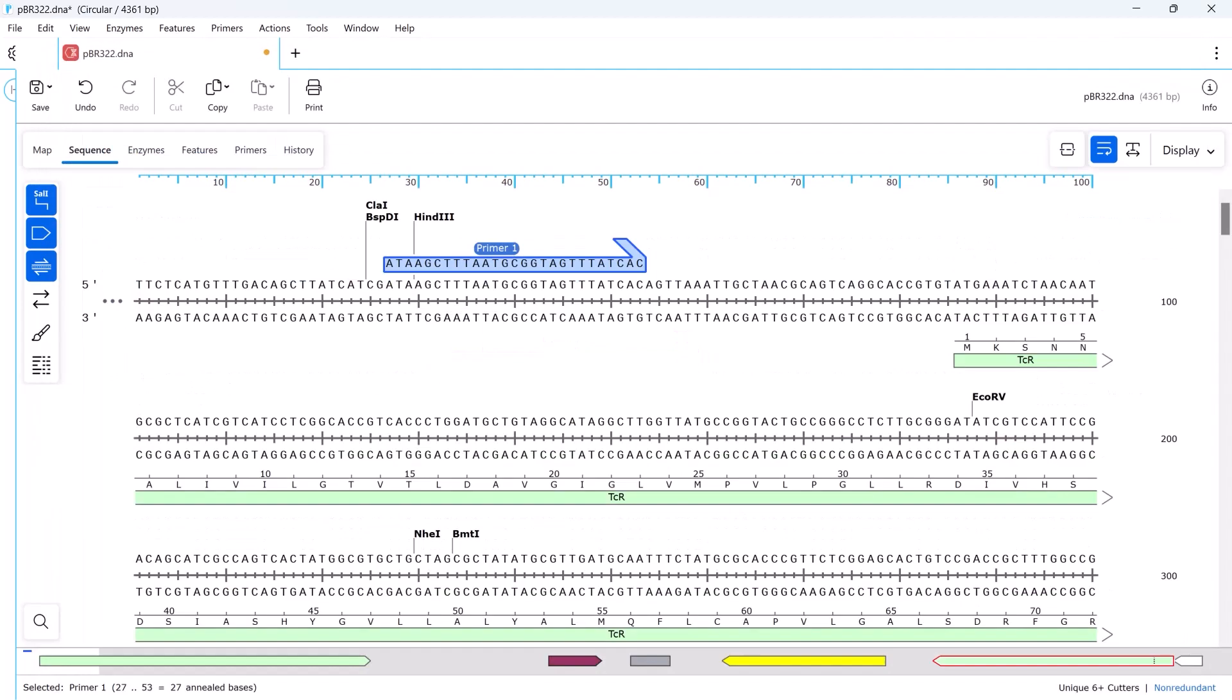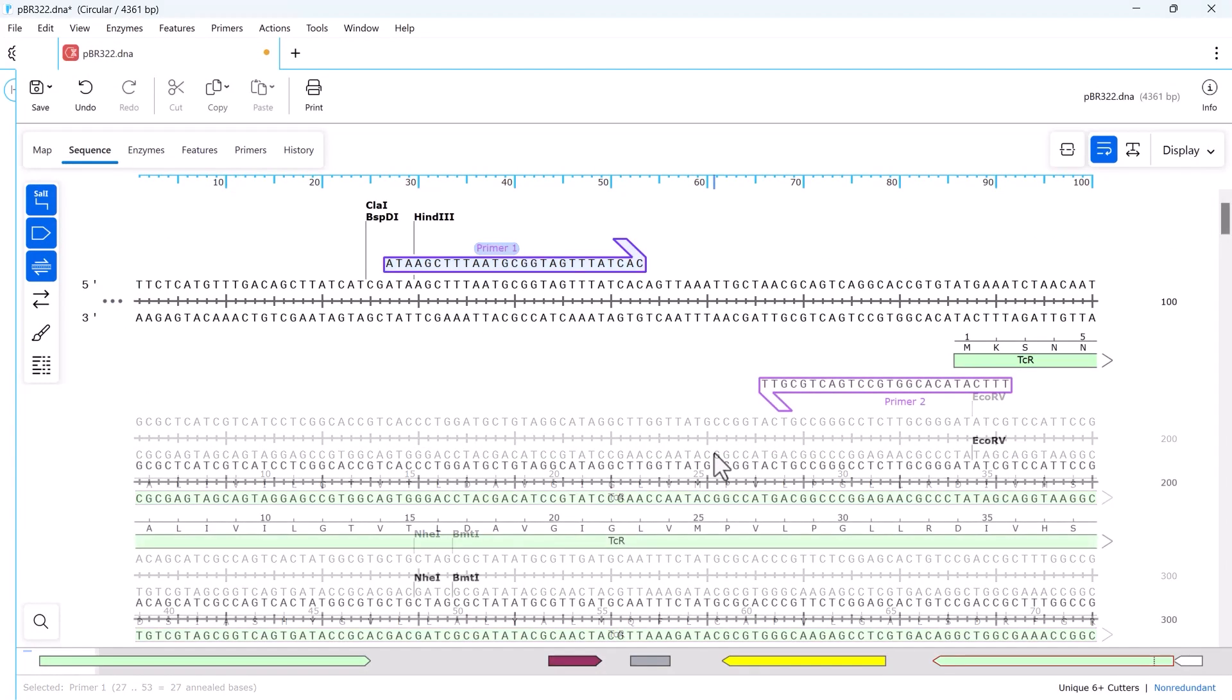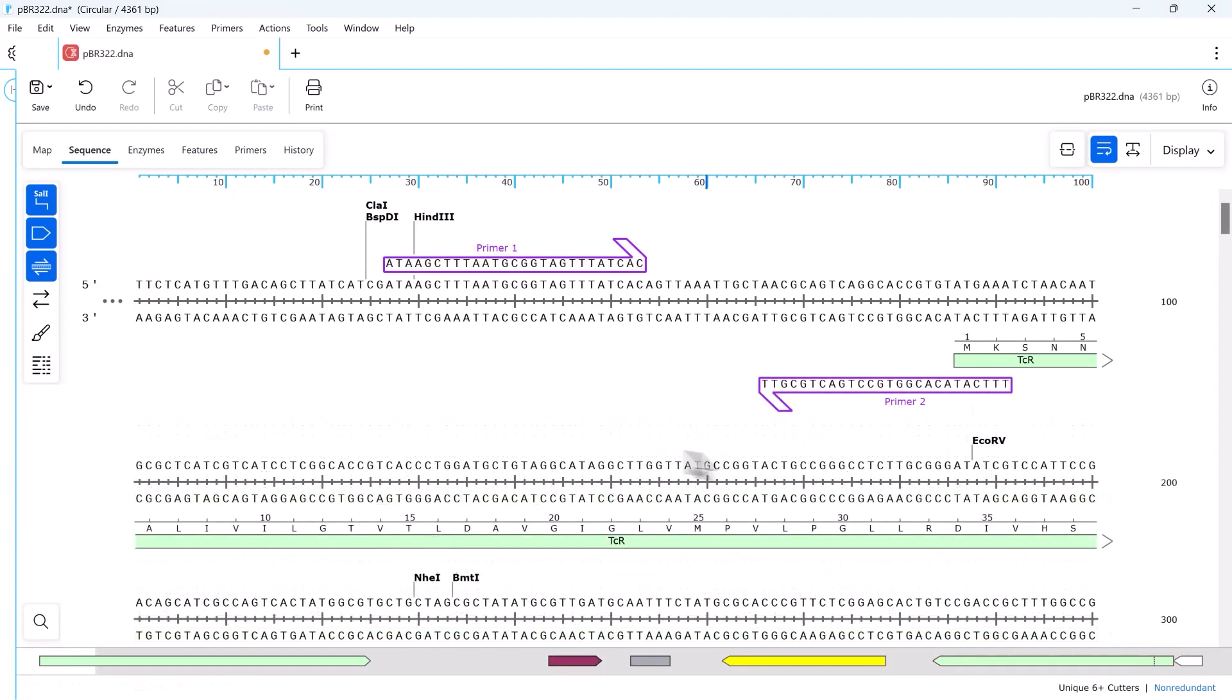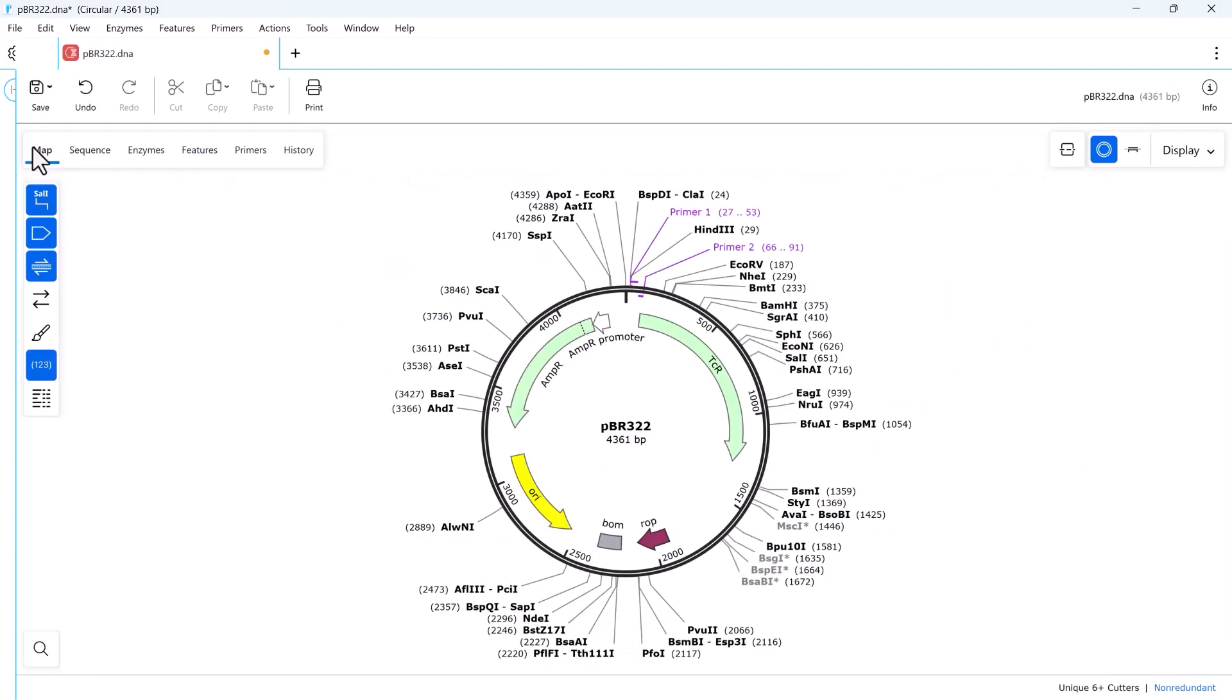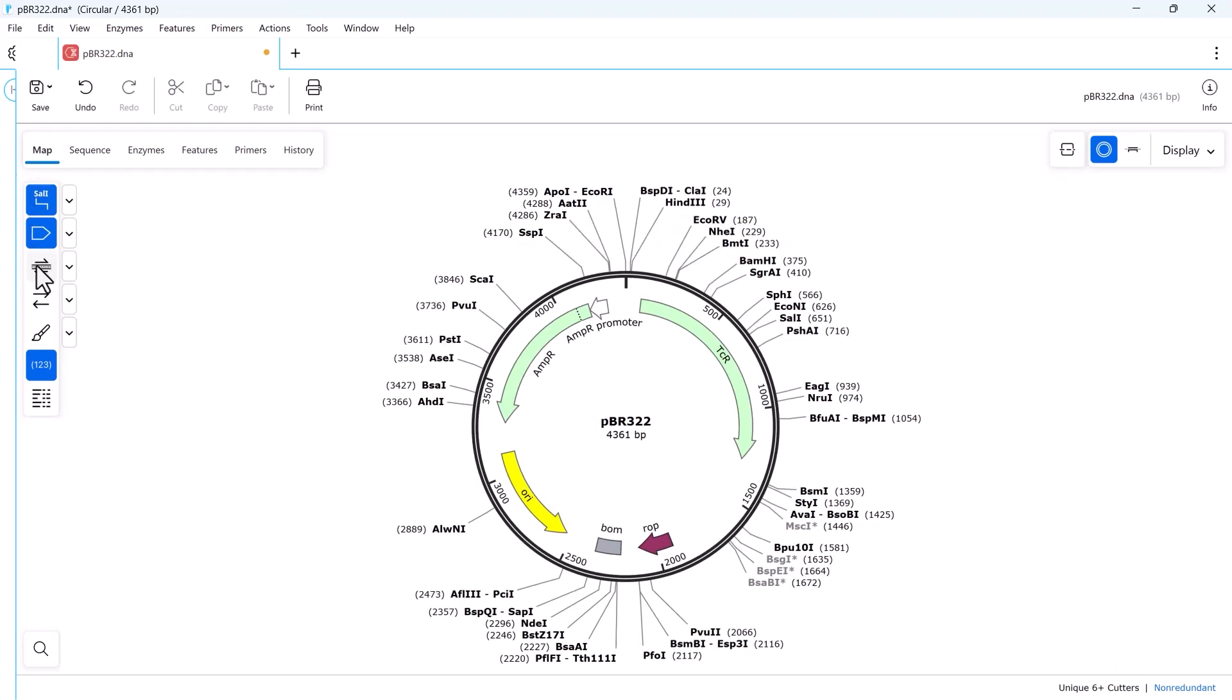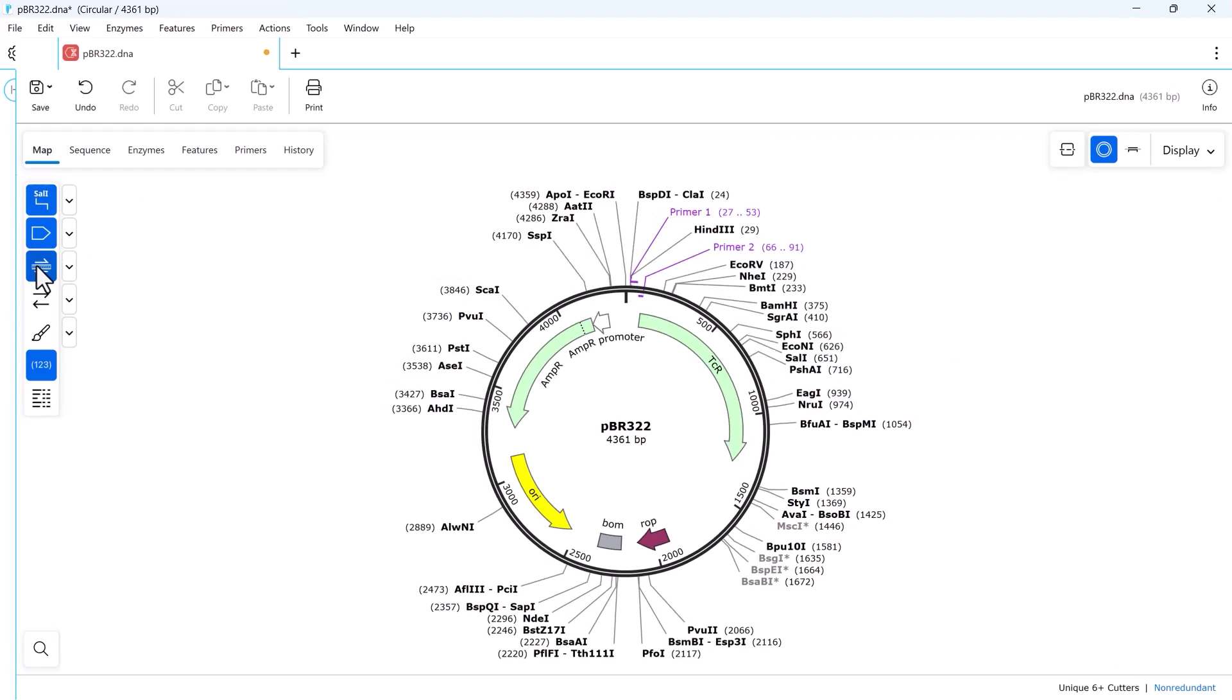Primers on opposing strands are clearly indicated in both sequence and map views. As with other annotations, you can toggle primers on and off from the sidebar.